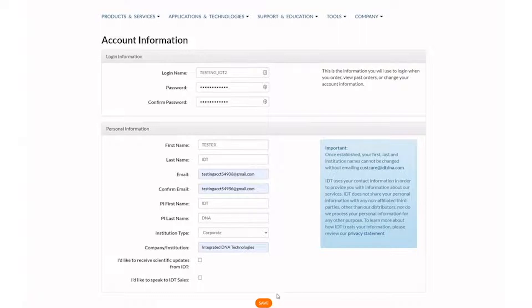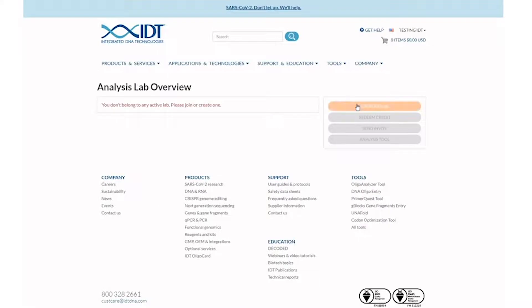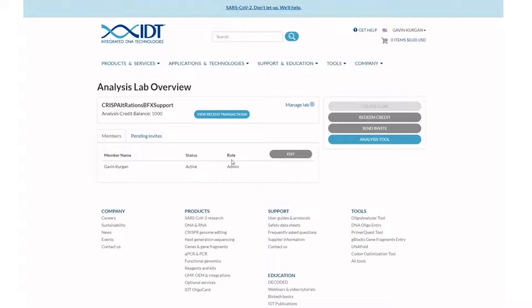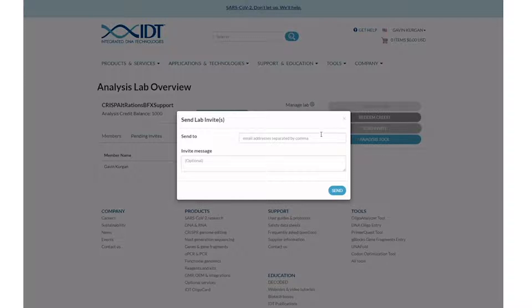Once you set up an IDT account, you will name the lab where all your data and analysis credits will be stored. Click the create a lab button to give a unique name to your lab. You can invite collaborators, colleagues, and students to your analysis lab using the send invite button.